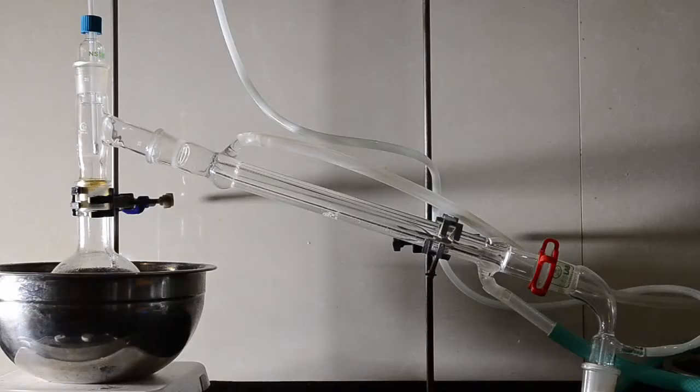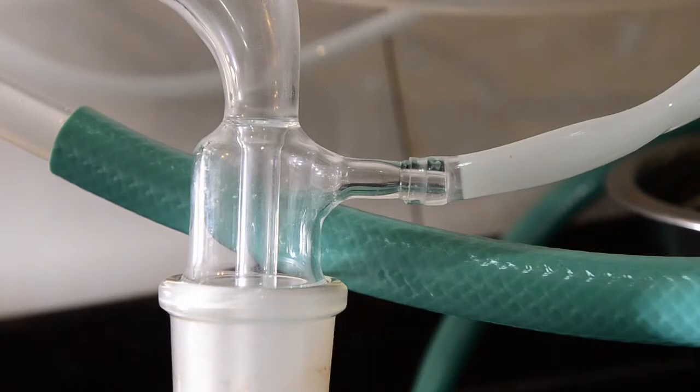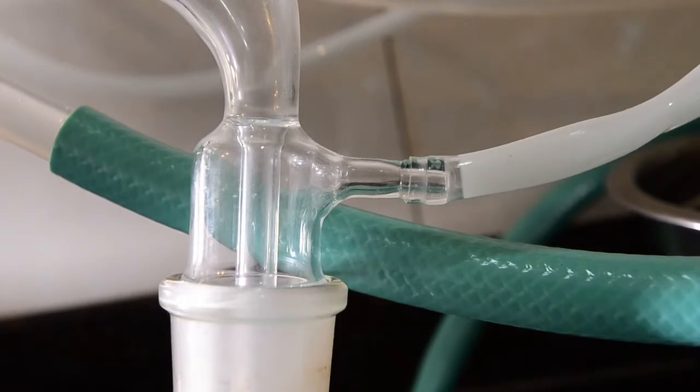Now set up the flask for simple distillation using cool water and a thermometer to monitor the temperature of the distillate vapors. We really recommend using a hose attached to a suitable receiving adapter, which can safely vent away HCl gas.